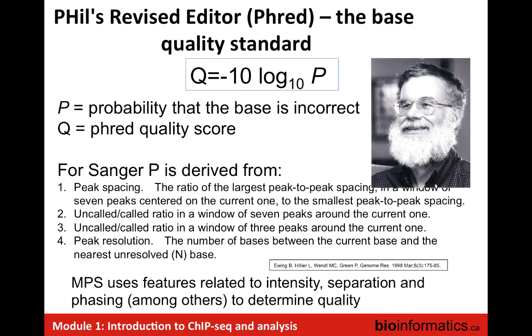So, of course, when we were sequencing human genomes, like doing ChIP sequencing, and aligning it back to the human genome, we would see mismatches, and we would count those as errors. But of course, many of those are polymorphisms. There's about 4 million positions different in your genome versus the reference, in my genome versus the reference, and so that was a problem with that methodology.